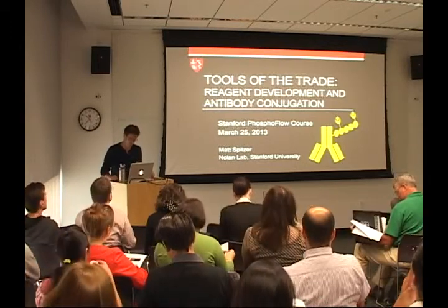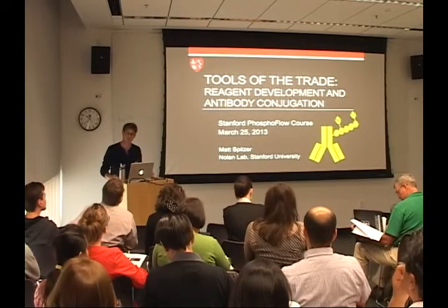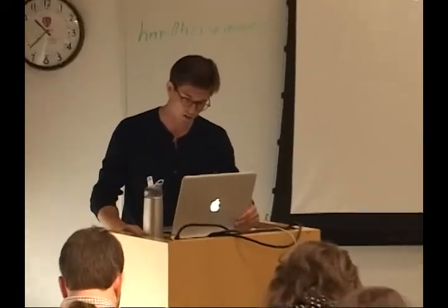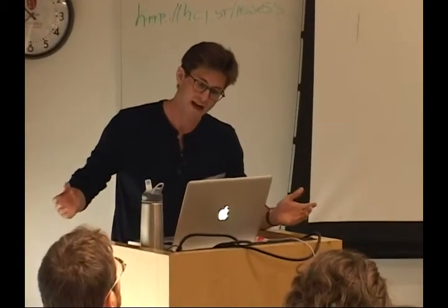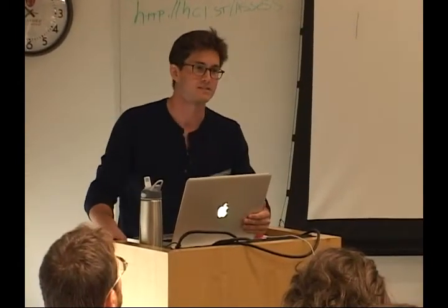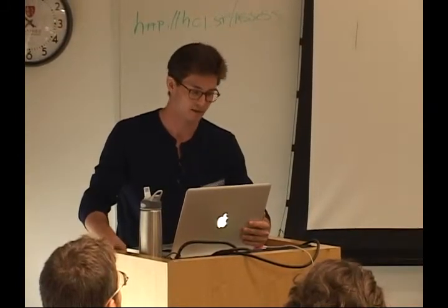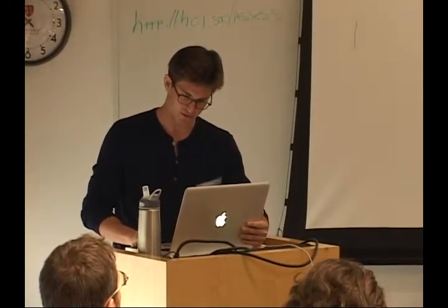workflow. So it's a little specific to CyTOF, although the chemistry is fairly similar for maleimide-based fluorophores as well. And then the second half is really going to be on validating reagents. So that applies equally to mass cytometry and fluorescence-based flow, whichever you may be more interested in, or both.